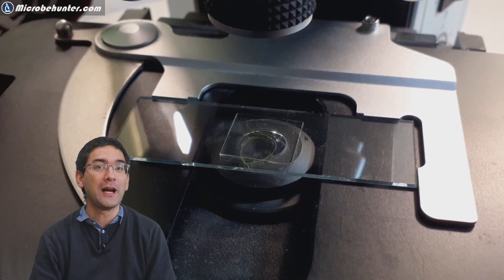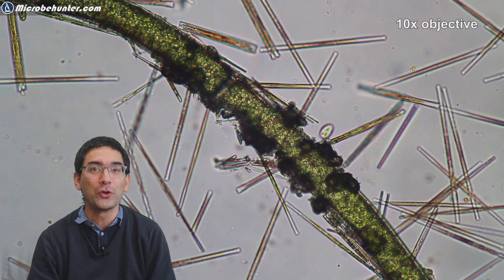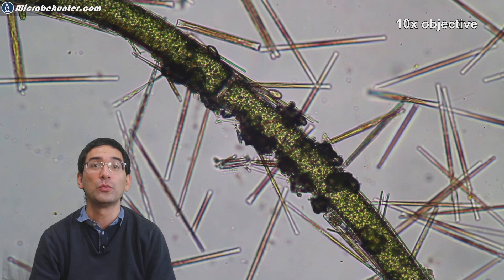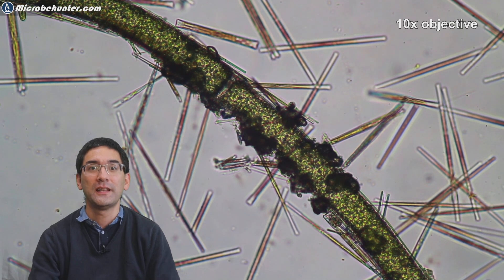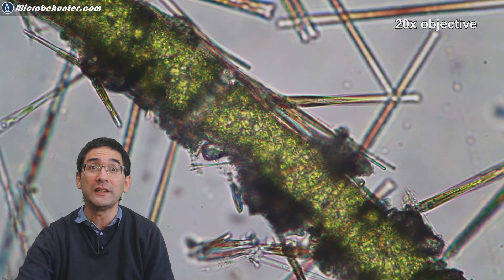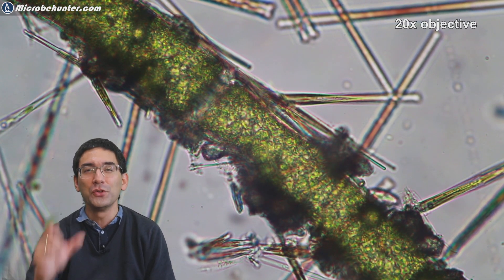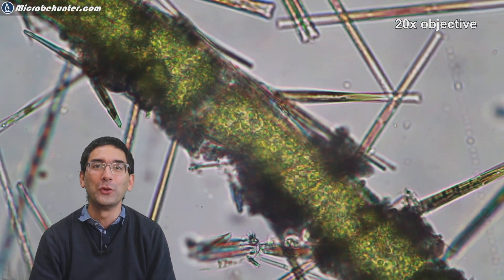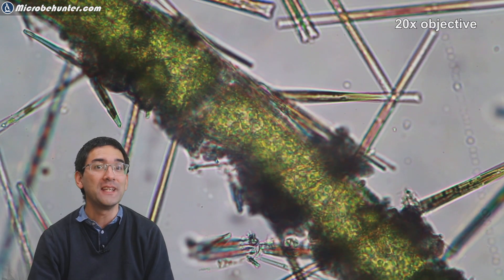Usually you do not need a very high magnification. I always start off with low magnification. Those large thick things that you see are the algae that I collected, and connected to it growing on it and also on the side, those stick-like structures, these are of course the diatoms. They are quite well known because they have a shell made out of silica.